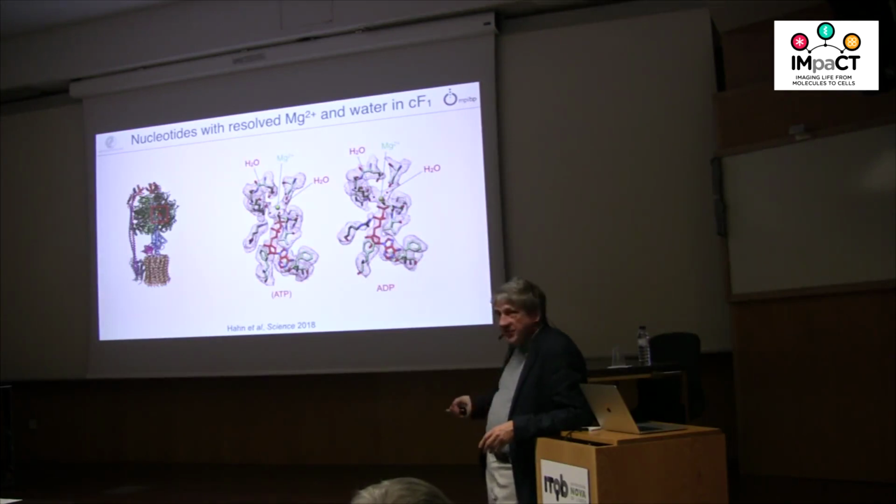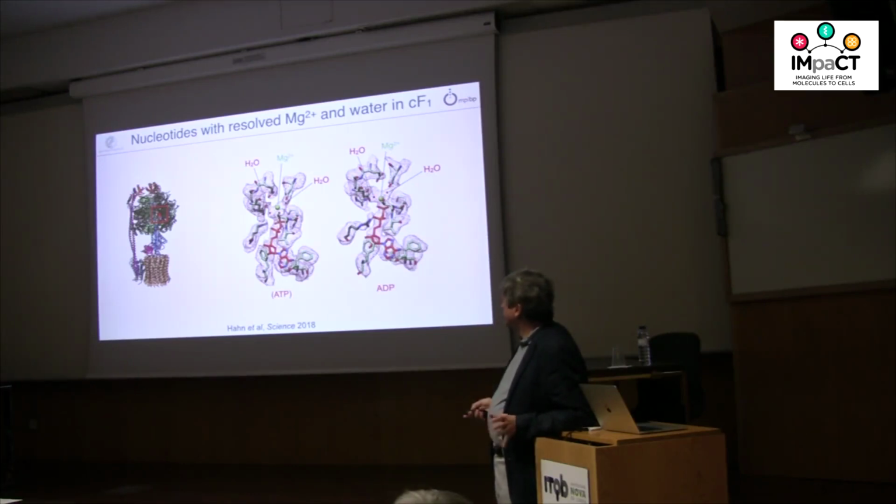They're both ADPs, as it turns out, because the ATP was hydrolyzed during isolation. You know this is the ATP site from the arginine finger here, from the position of this arginine, which is a particular conformation in the ATP binding site, and the ATP site has changed. And this is how we know one is the other. If you can resolve the magnesium, you resolve the H2O, the water molecules, even though this is not quite such high resolution, this is 2.9 angstroms, but still you can see water, you can see magnesium, which is quite nice.